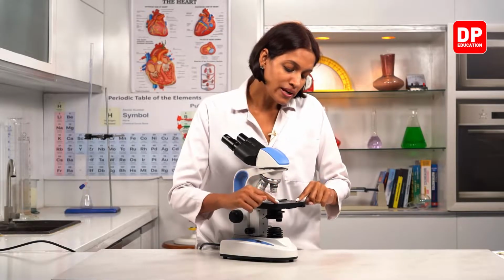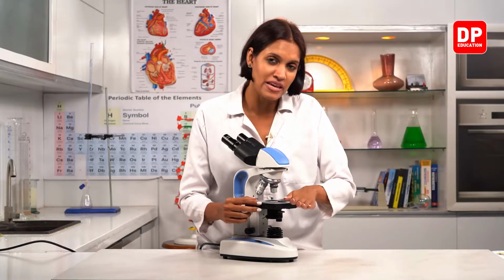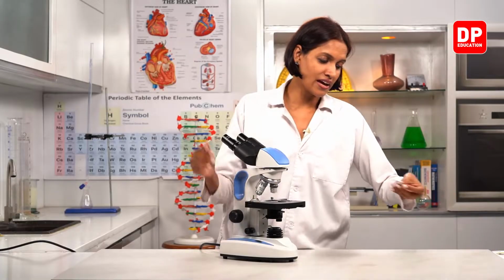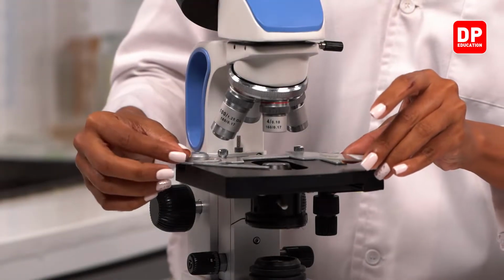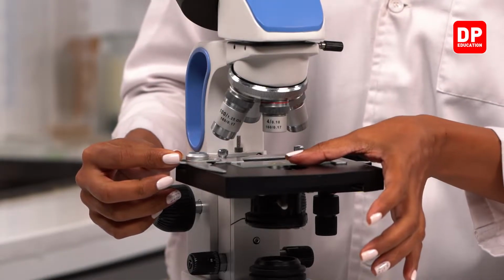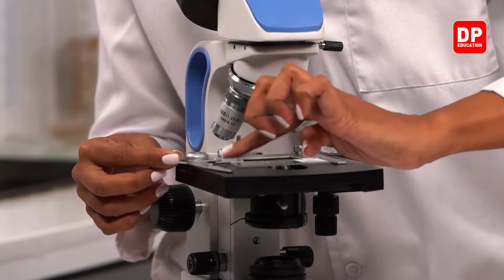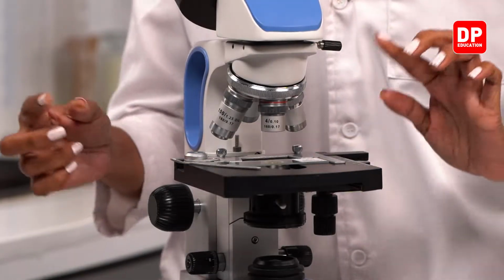Now, what is this part, children? This is called the stage. This is where we place the specimen or our object. Here I have a slide. This is a permanent slide with a specimen. Then I have to place this slide on this stage, and after placing it I have to fix it with this stage clip. It will not move here and there then, right?